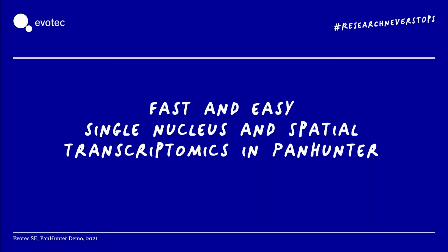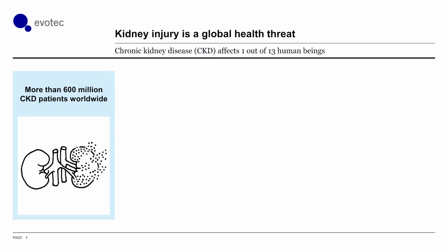Welcome to this hands-on demo of PanHunter. In this video, we will show you our capabilities in the field of single nucleus and spatial transcriptomics. Everything you will see is happening in real time.